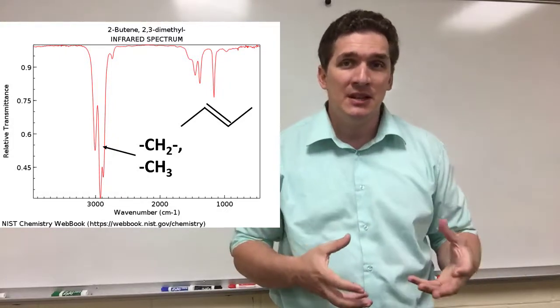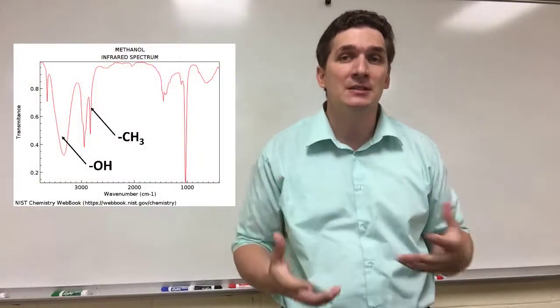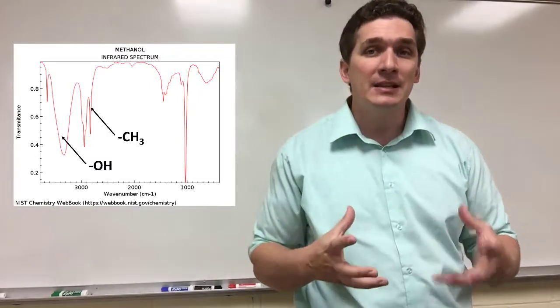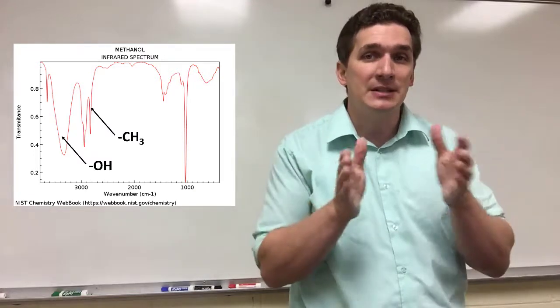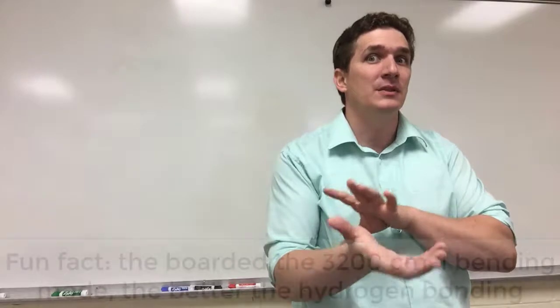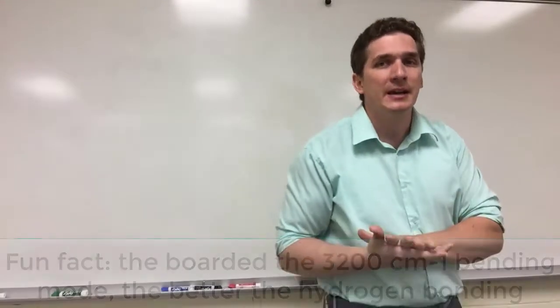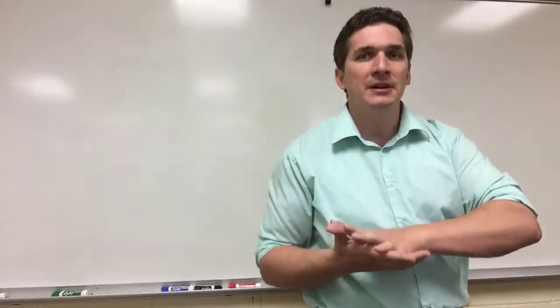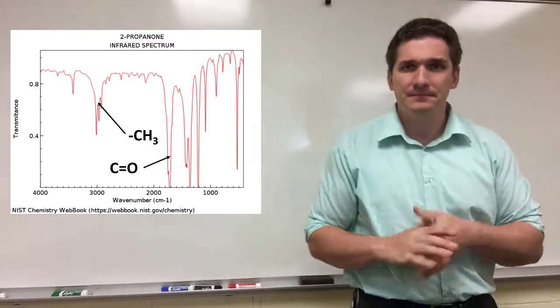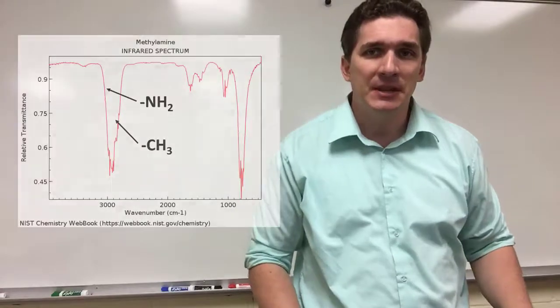If we have oxygen-containing compounds, something like alcohols, these are typically broad peaks, especially carboxylic acids, and they're broad because the OH groups associate with each other. If they were isolated and weren't exchanging, we would actually see a defined signal, but because the IR timescale is so short, the OH groups get broadened out. Versus something like a ketone or an aldehyde: because those don't participate in hydrogen bonding and they're not exchanging hydrogens, they typically tend to be more narrow bands. If we want to find NH groups or amine functionalities, we'll see those in specific areas.